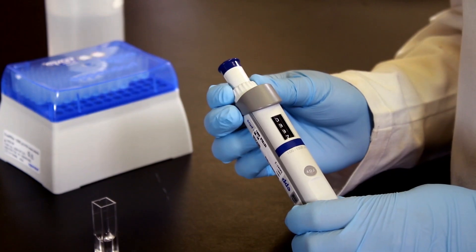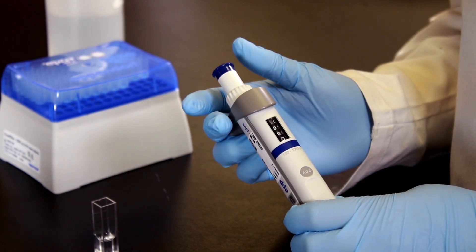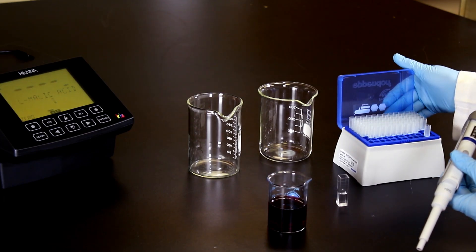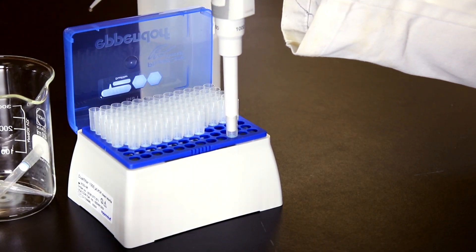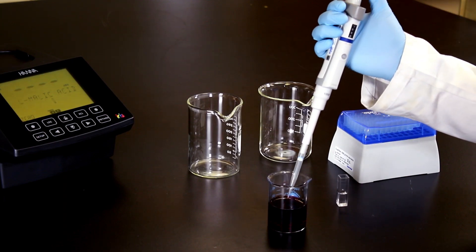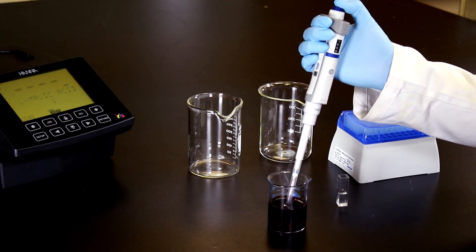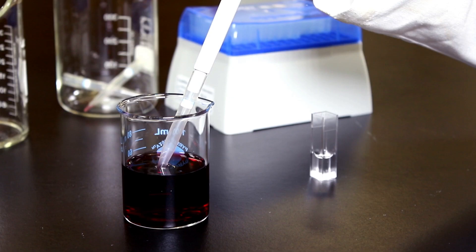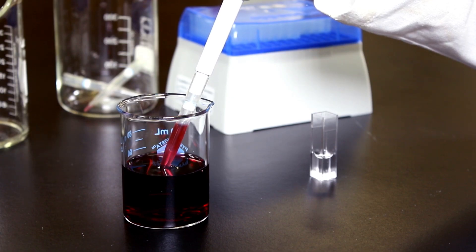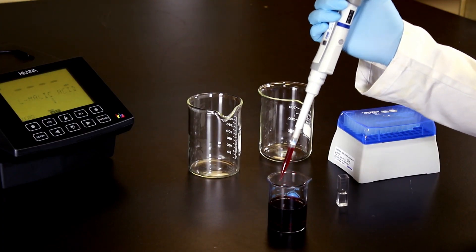Before drawing up your sample, be sure to adjust your automatic pipette to the desired volume. To draw your sample, compress the plunger to the first stop to expel liquid and release the plunger to draw the liquid three times. This will help coat the pipette tip with the liquid and keep liquid from catching in the pipette tip.